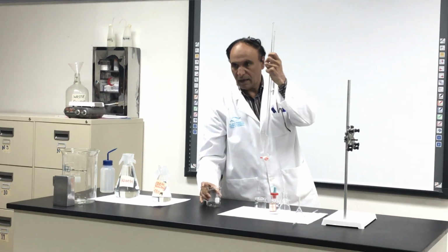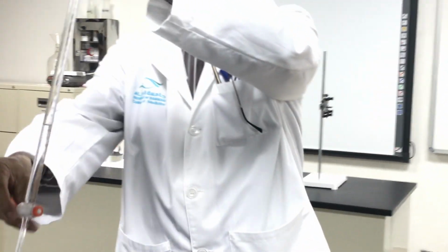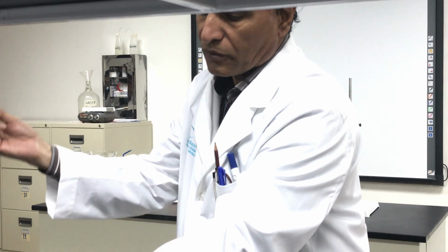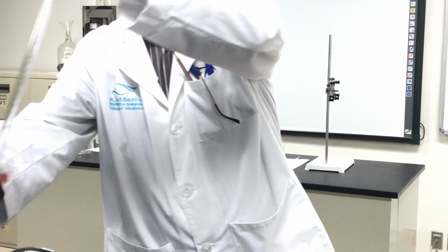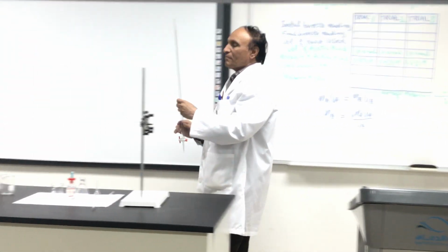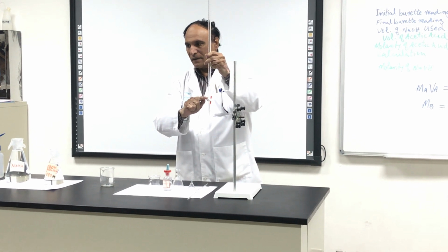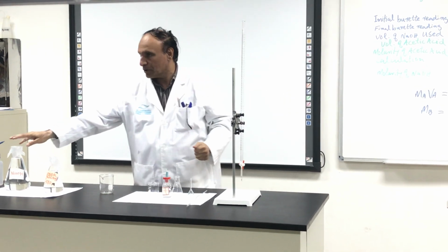You can throw the liquid into a beaker, or even over here if you are doing the experiment here. Then you close it, move it like that, and throw some liquid over here and the other there. So you see that now it is washed with water, but there are many water drops. And I will put sodium hydroxide into it.